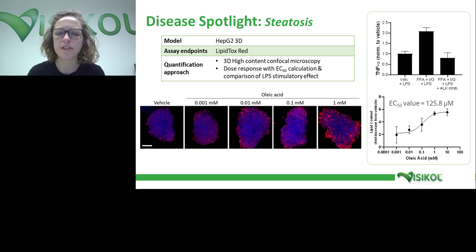Here we used a much more simplistic 3D cell culture model, and I just wanted to call attention to that. So we used HepG2 cells, which is an immortalized liver carcinoma cell line. The reason is they can be much more high throughput, because you can continue to propagate these cells in culture without the need to continually rethaw primary material and worry about the lot-to-lot variation. This brings down the cost of this assay at the expense of evaluation of more advanced stages of the disease, but it allows us to get a good approximation, at least if you're looking to do some side-by-side comparisons.